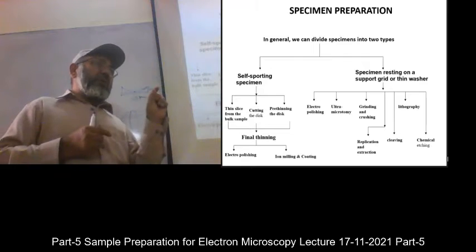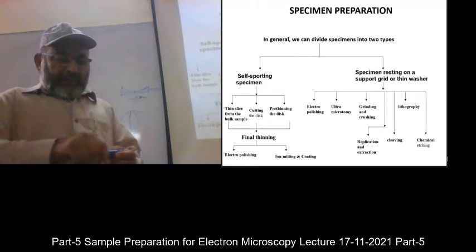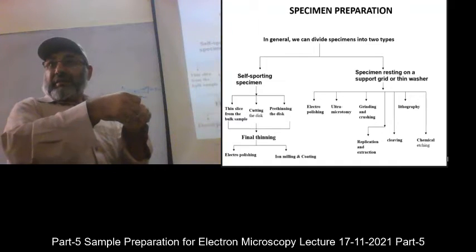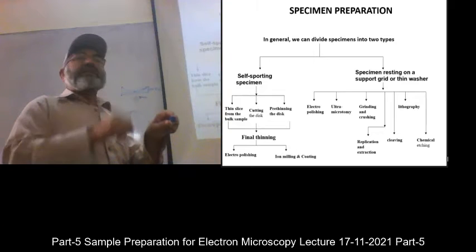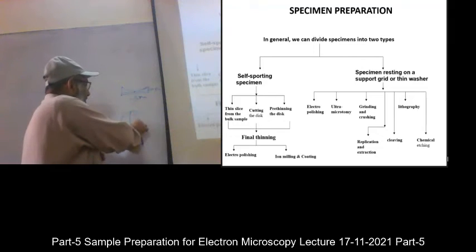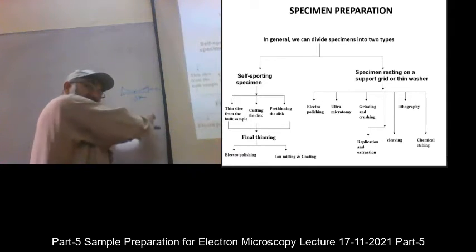One side is sticky. So when you pick the wheel like this, if this is the wheel, then you cover it with that sticky cloth, and then you put a little bit of diamond paste. So the cloth very finely rotates here like this.